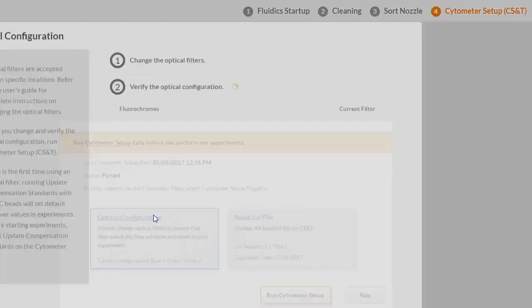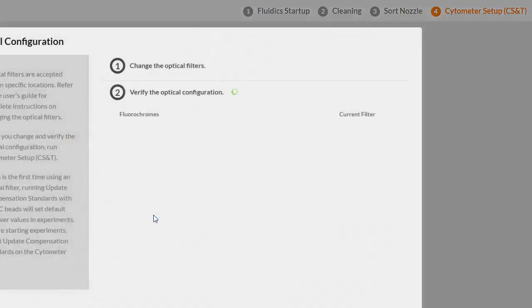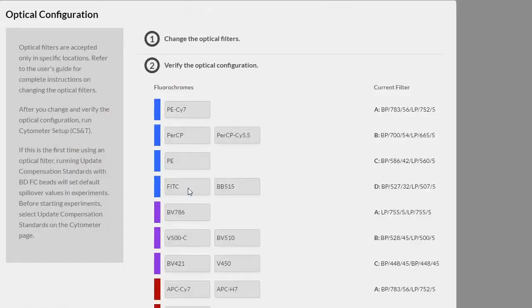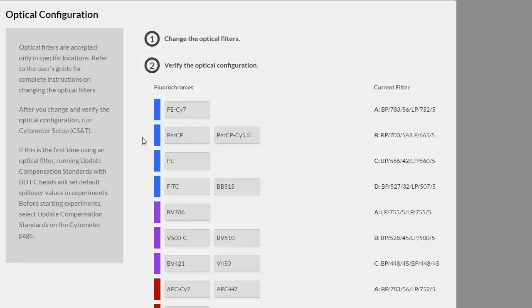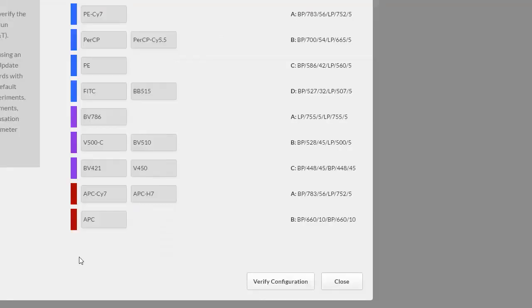The current configuration for the BD FACSMelody is displayed. For demonstration purposes, let's view the configuration. Optical filters are accepted only in specific locations. Refer to the filter guide and user's guide for more information regarding changing the optical filters. The current configuration lists the fluorochromes for each laser on the left and the current filter on the right.